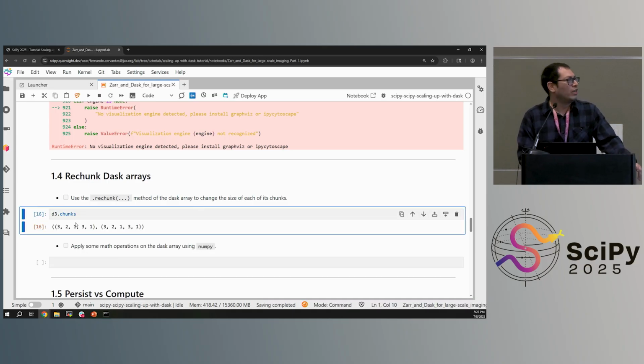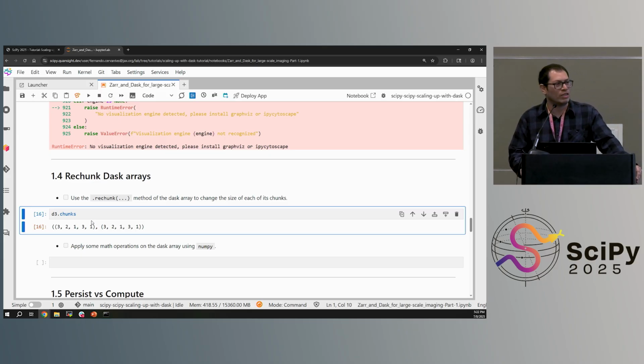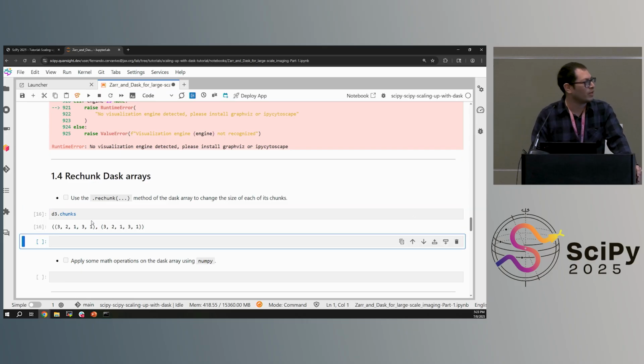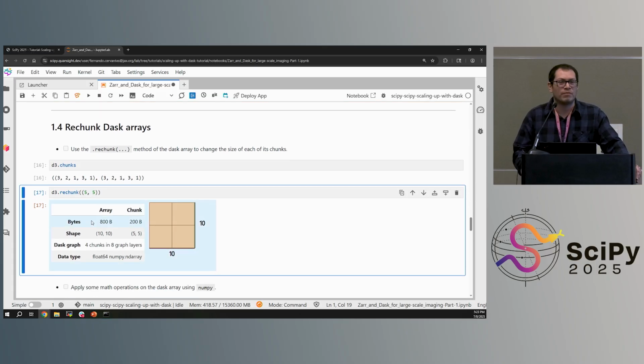So we're going to take some time to actually code. The idea is to give you some insights into coding that on your own. We are going to be using some examples of how to use Dask so we can familiarize ourselves with Dask before jumping into using it for inference on large scale images. We're going to have some examples, and then I'm going to give you some time to go through some exercises on your own and show you the solution, or proposed solution, later.